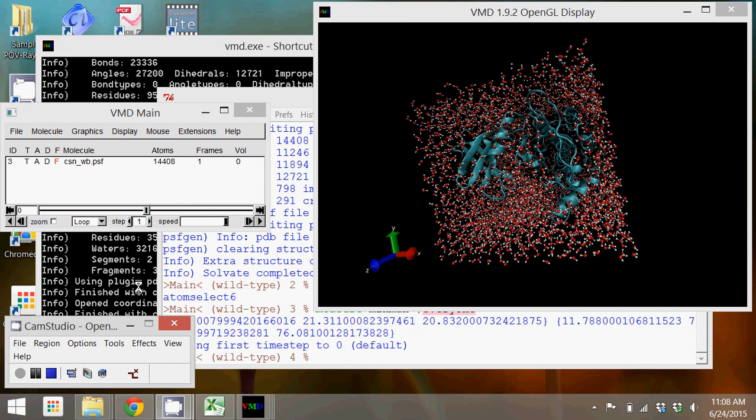In this tutorial, I'm going to show you how to equilibrate and simulate your protein or enzyme in VMD with its interface to NAMD.